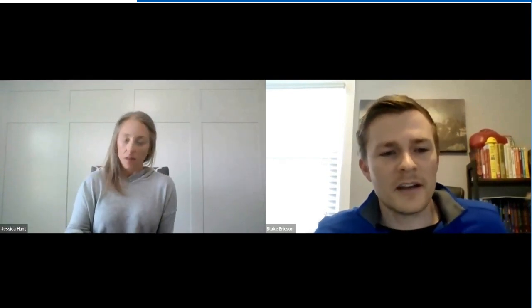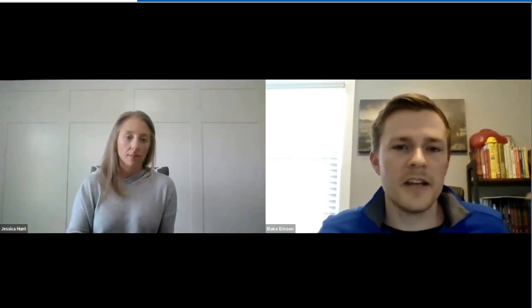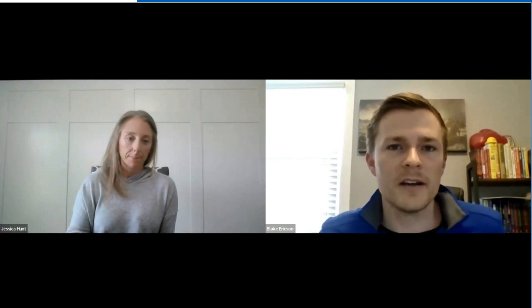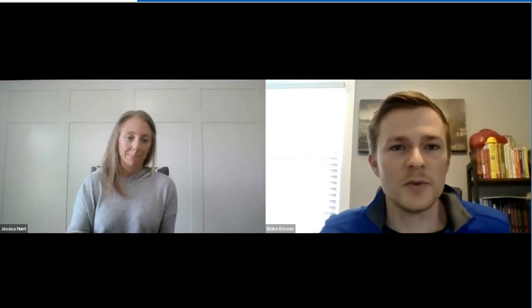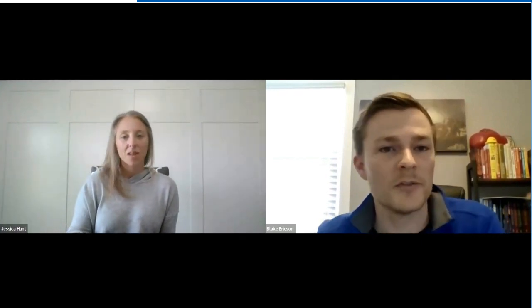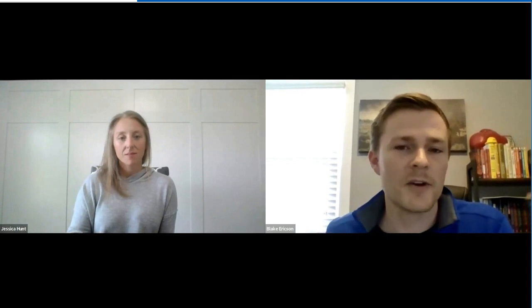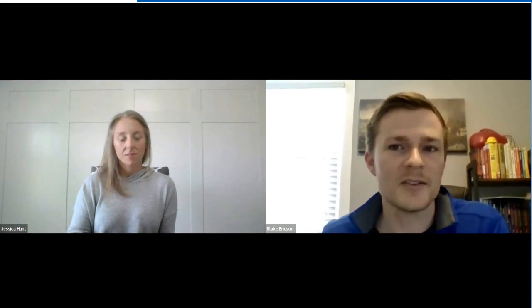Yeah, key takeaways, right? Validate your data. If you don't do it, it's an absolute must. Don't be afraid of the FTIR. It's not a black box or a voodoo box or anything like that. It's a powerful instrument. When it's used in the right hands, it can be used for engineering and for compliance and even processes like SEMS and all sorts of process optimization.